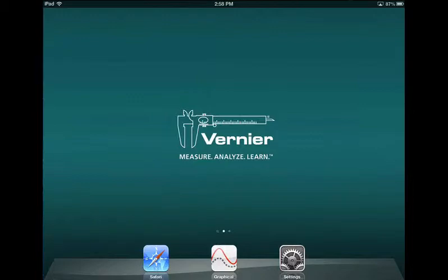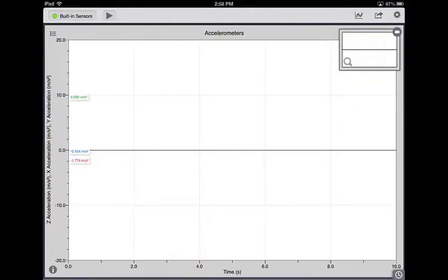Launch Graphical Analysis on your iPad. If this is the first time you are using Graphical Analysis, the app will be set to use the built-in accelerometers.